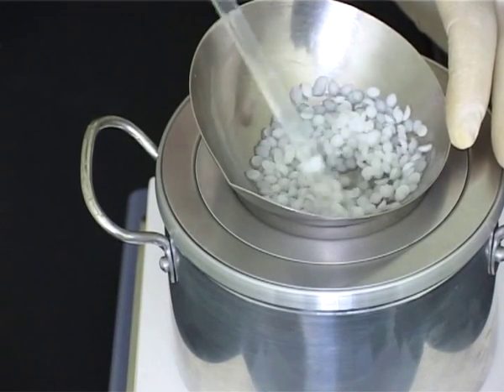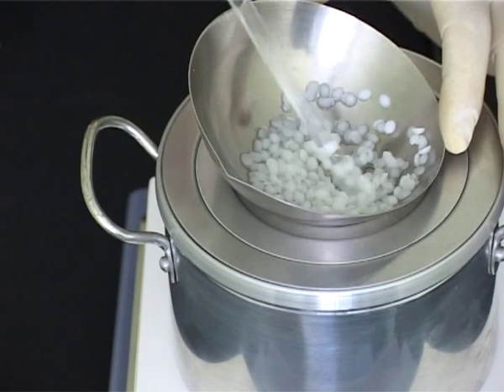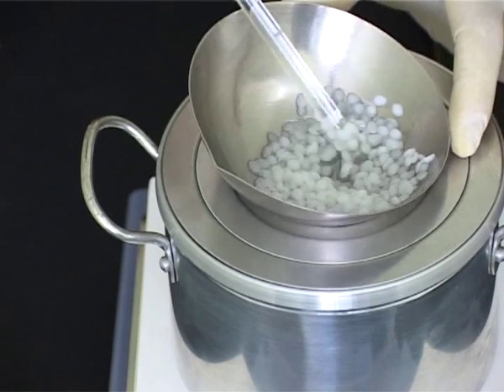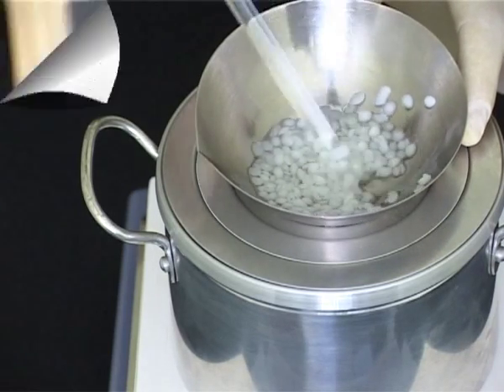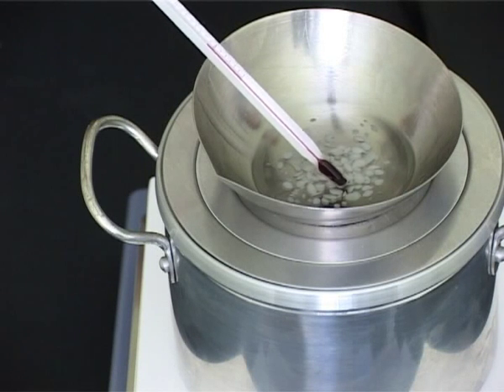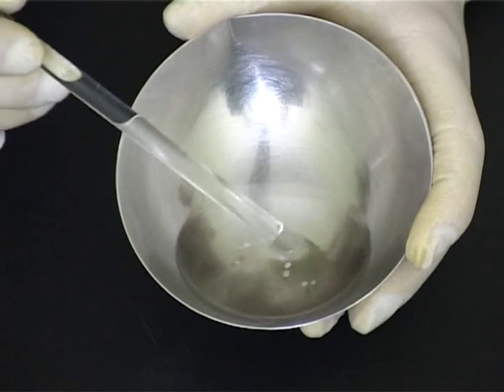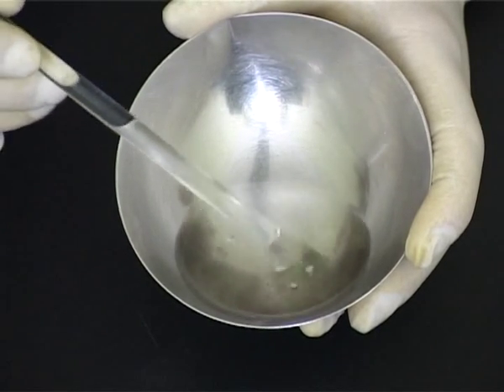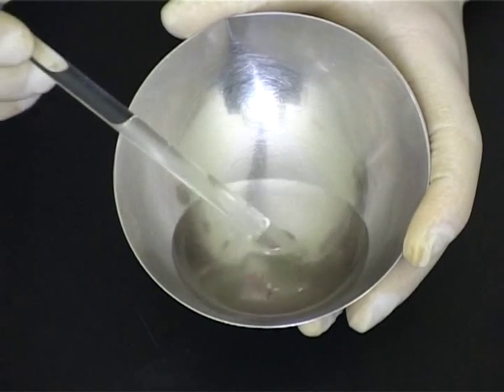Remember to stir to assist melting and to ensure an even temperature throughout the base. Check the temperature and remove the evaporating basin from the heat. Some solids will still be present but the residual heat should ensure that it melts. Stir to assist melting of the remaining solid.